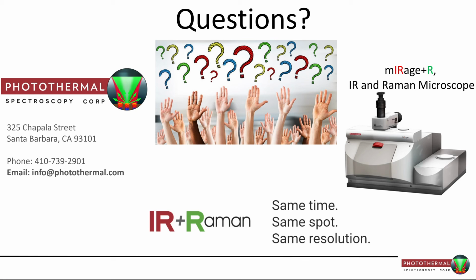Actually, that's a really good point, because a lot of people go to a lot of trouble to prepare the sample appropriately for FTIR measurements, and like you say, transmission gives you the best quality data typically, but for transmission you need very thin sections, which depending on the sample can be very difficult.